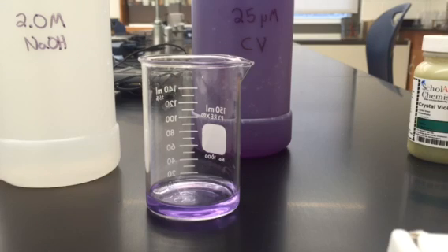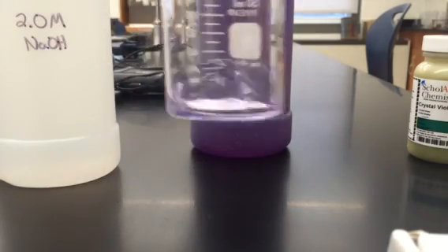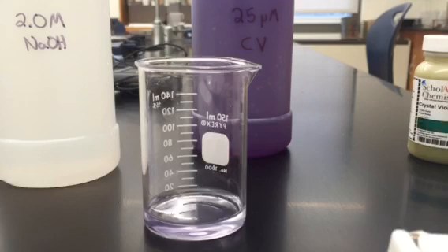As you can see, the crystal violet is beginning to fade, and it's actually fading quite rapidly. As long as sodium hydroxide is provided in excess, the solution will eventually become clear, and this provides a wonderful reaction to study rate laws and kinetics.